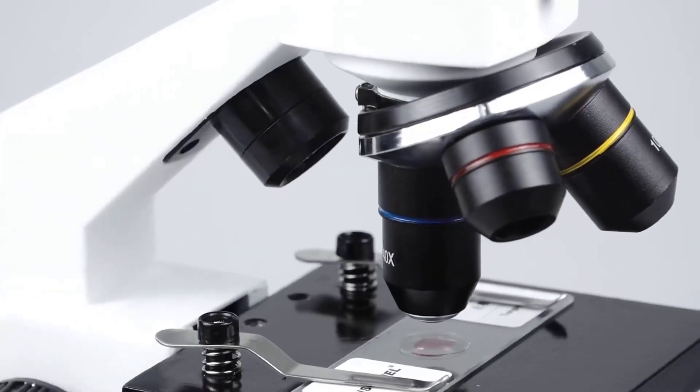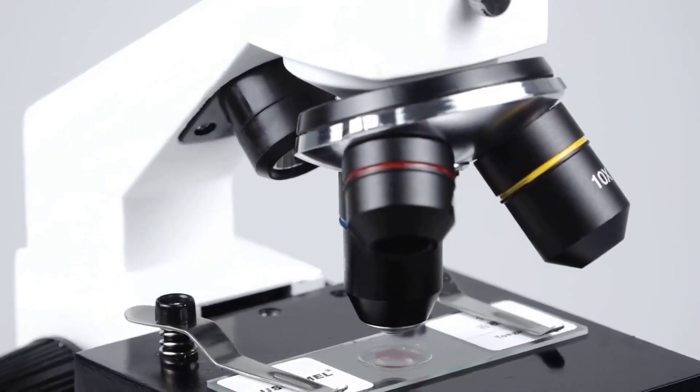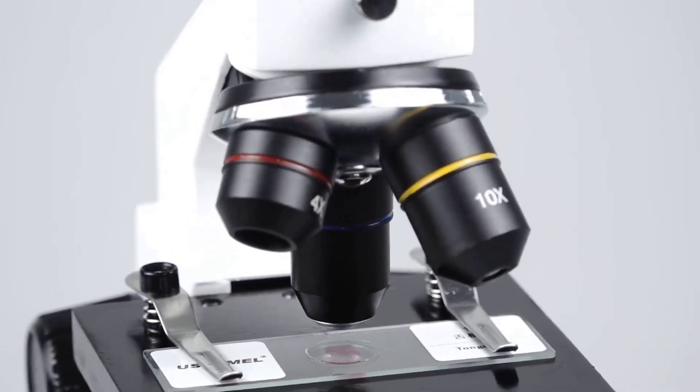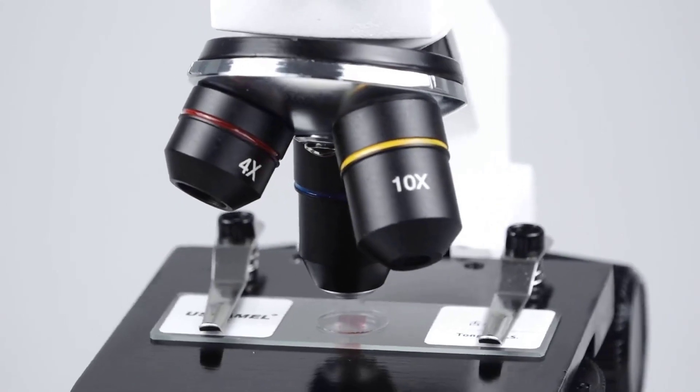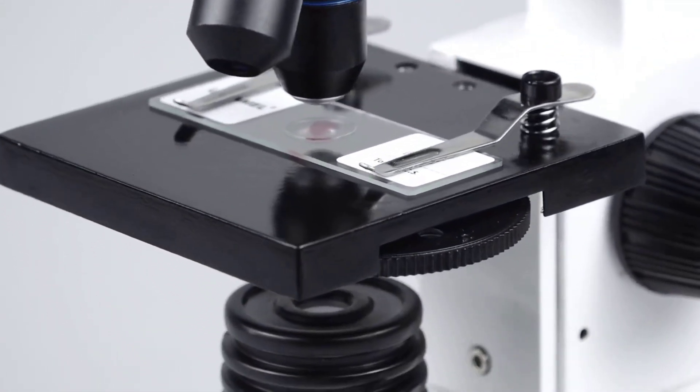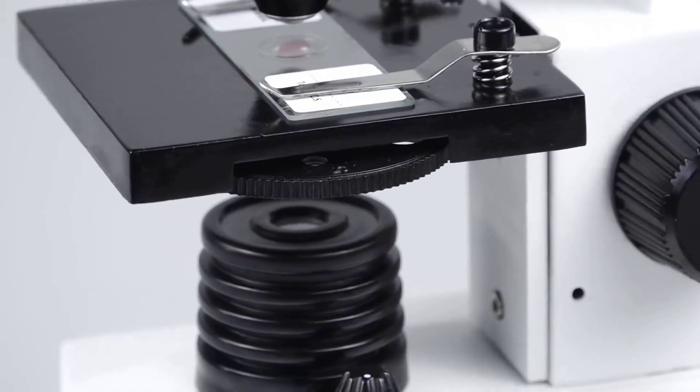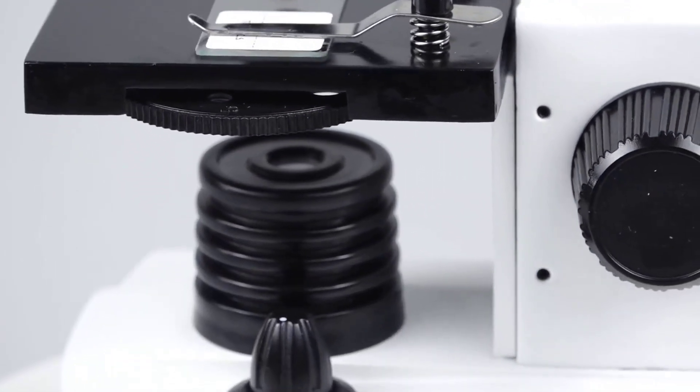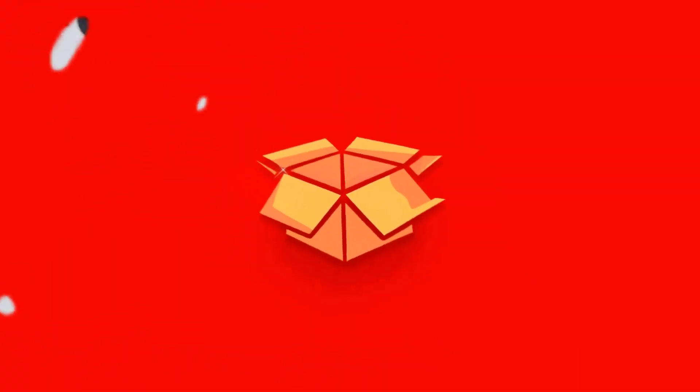While not engineered for professional laboratory applications, its user-friendly design and included accessories make it particularly well-suited for educational purposes and hobbyist use. For those beginning their microscopic exploration journey, this microscope delivers a reliable and engaging experience right out of the box.